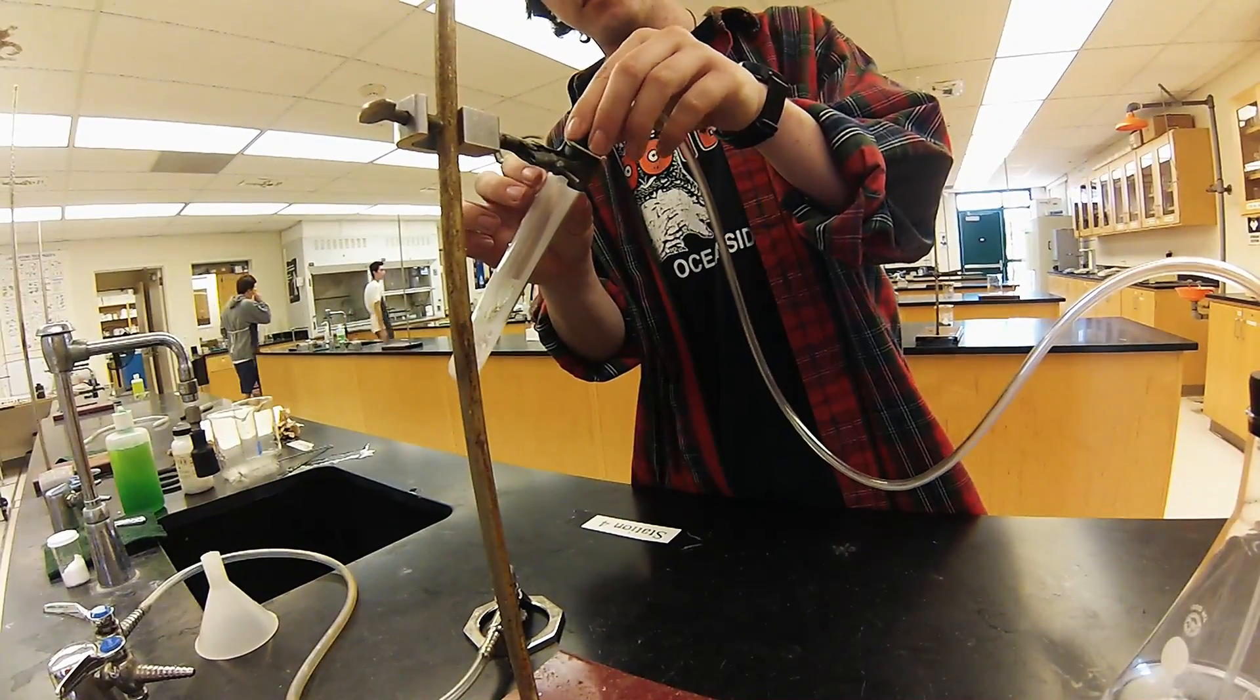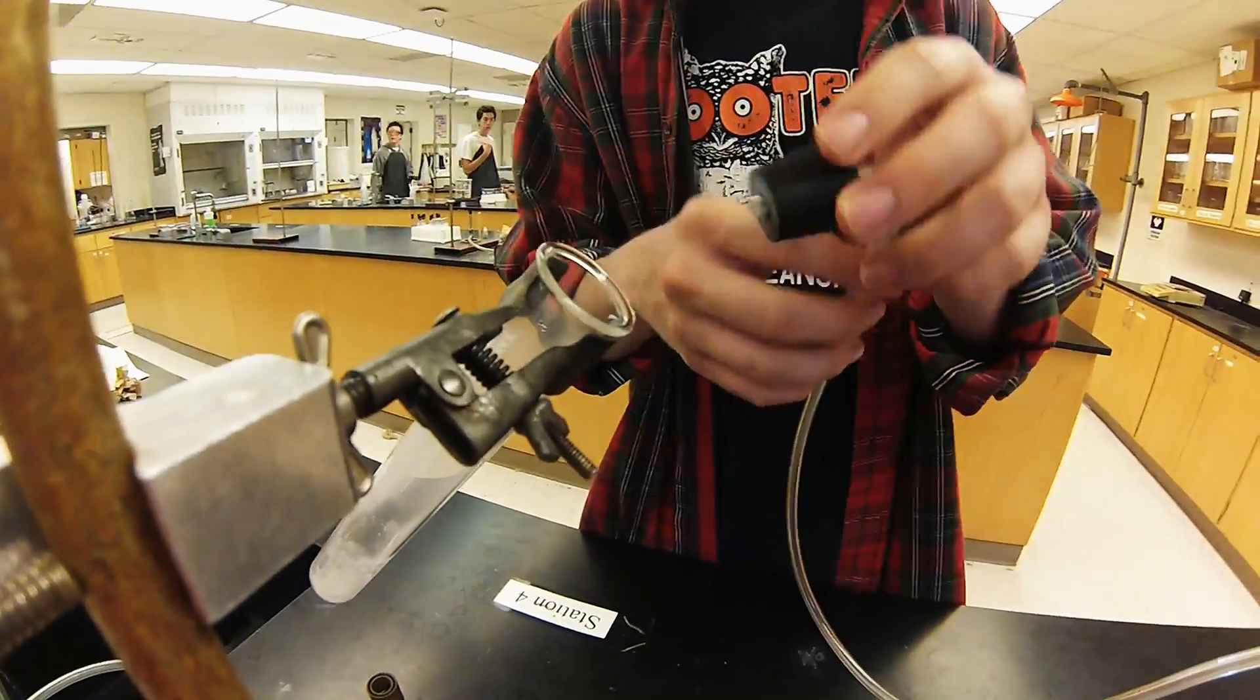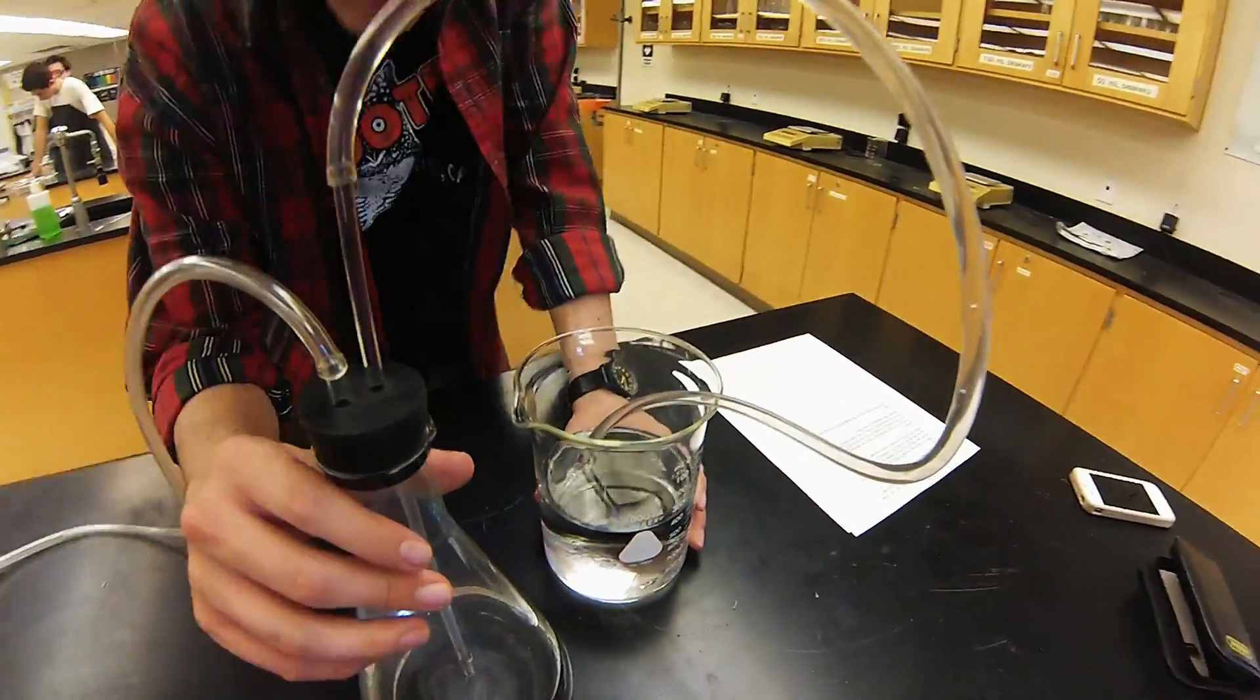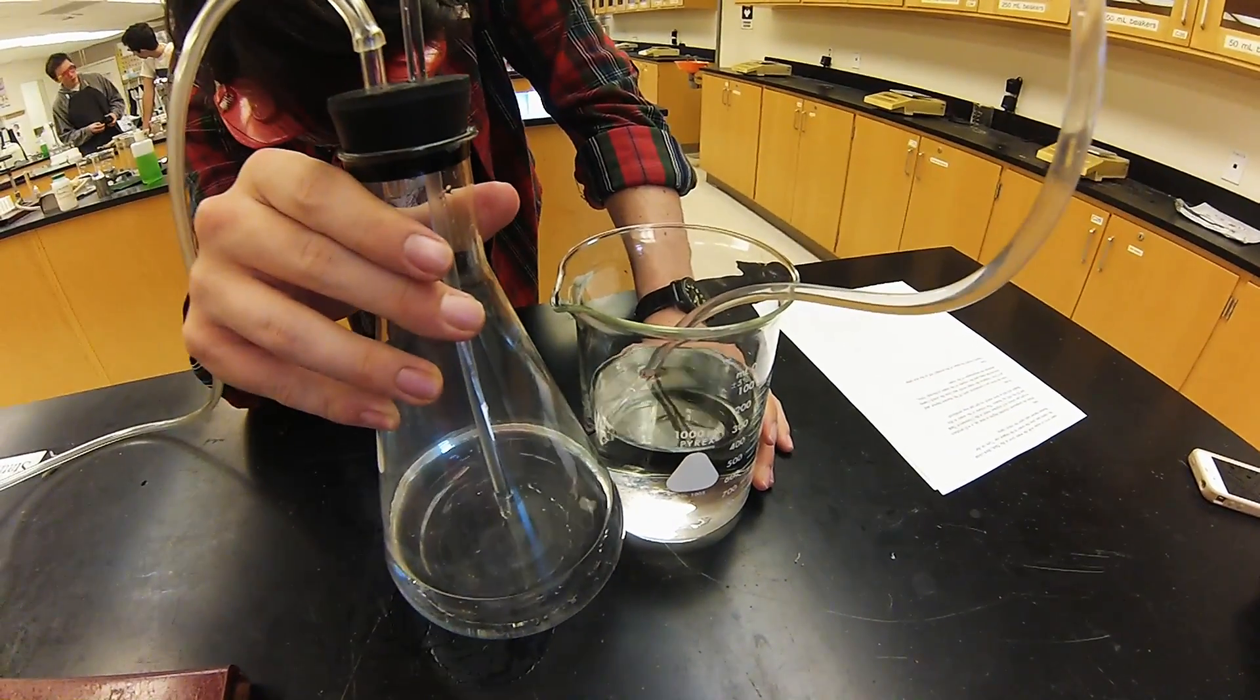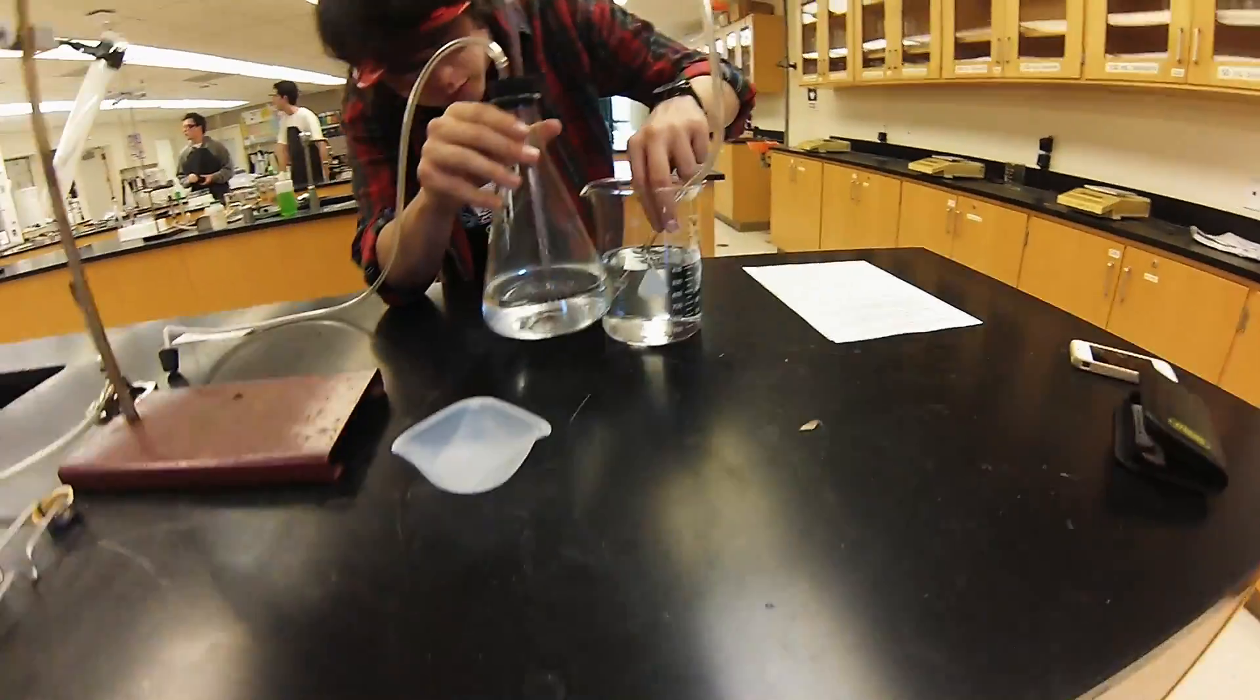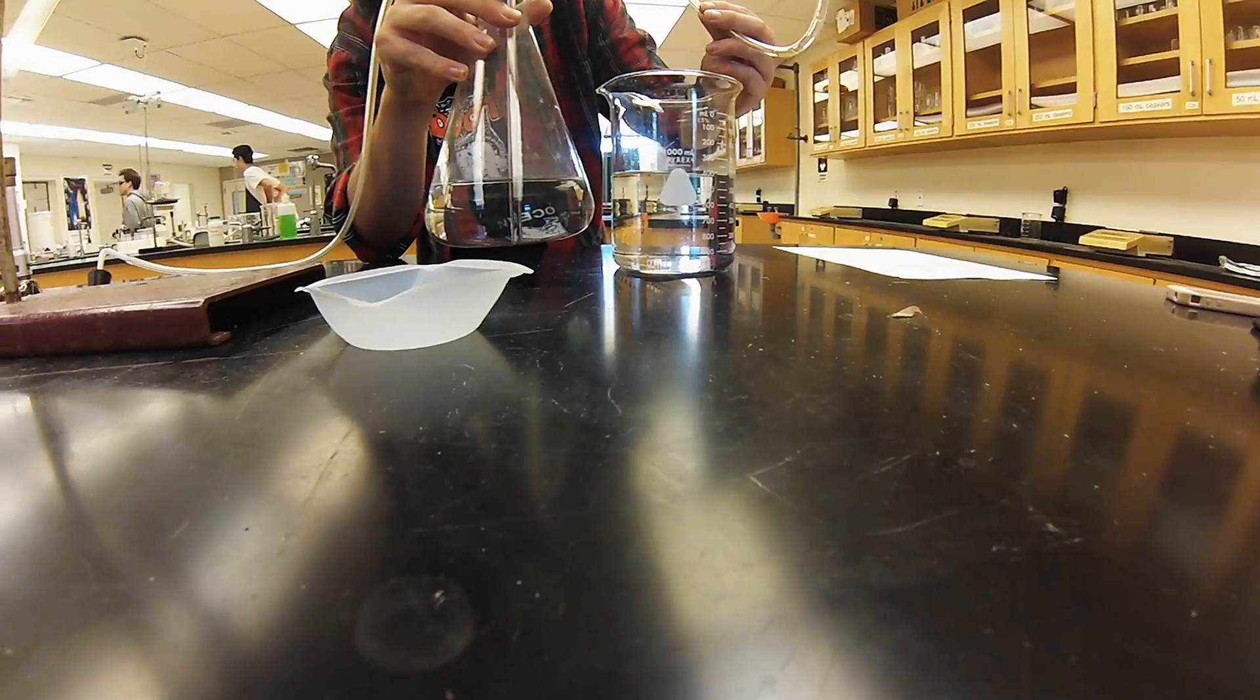Then holding the water levels in the Erlenmeyer flask and the beaker equal, and then removing the tube from the beaker.